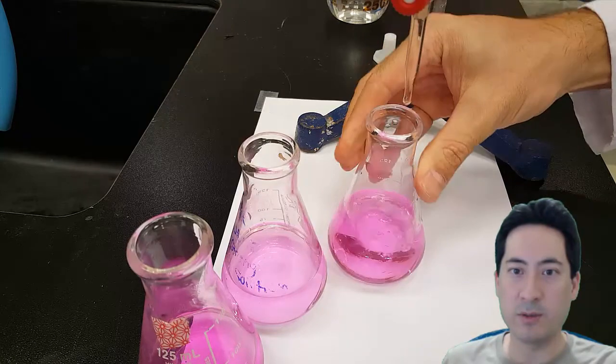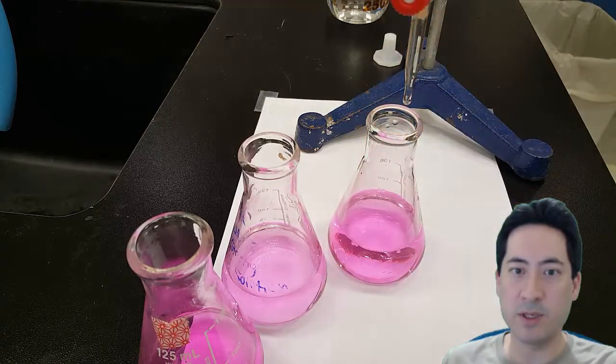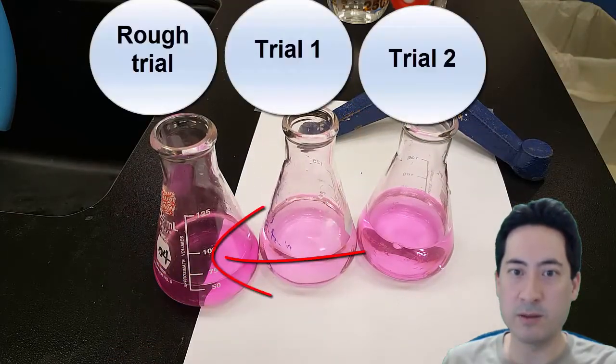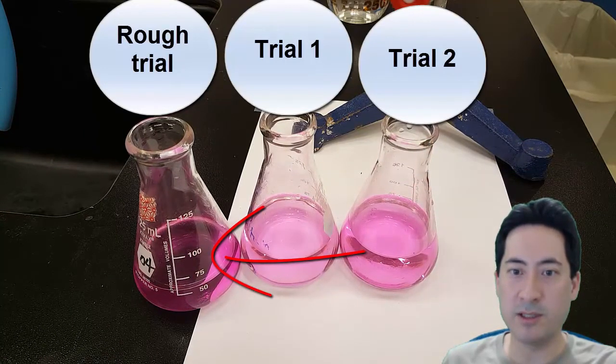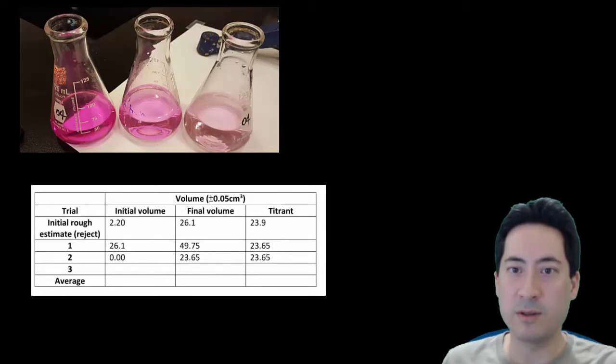And if I add one more drop, you can see that the pinkness goes right over to that almost to the rough area here. And so that area of where it was just lightly pink, that was also, you can see from this picture here, was 23.65. So I'm taking that as my end point.